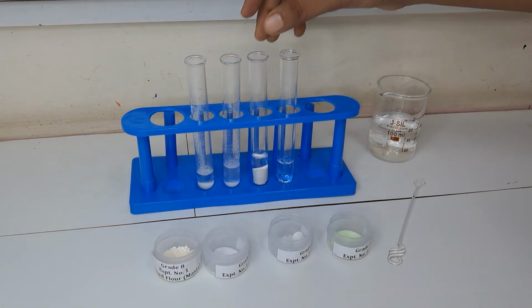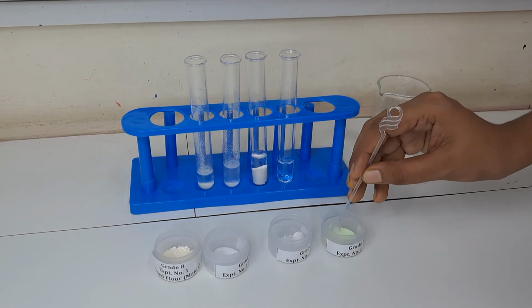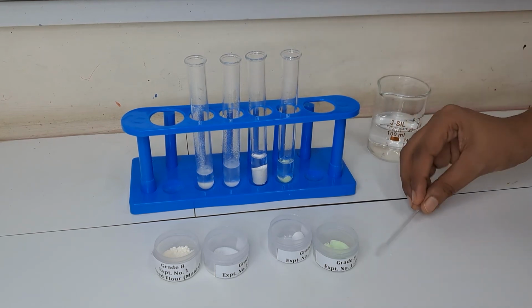Now in the fourth test tube, you have to add ENO. It's a fruit salt; you can also add that, but here we have provided ENO to you. So you can add ENO in it and observe very carefully.